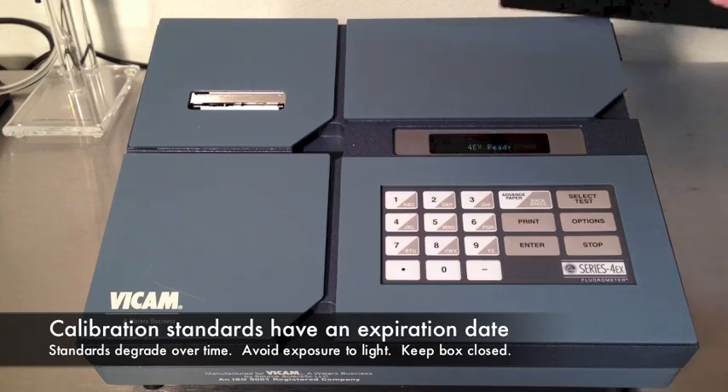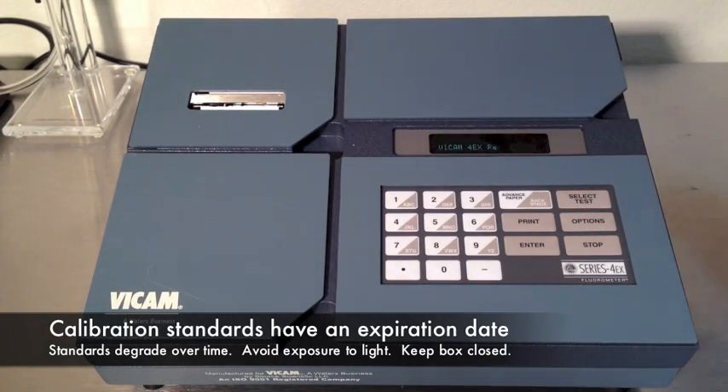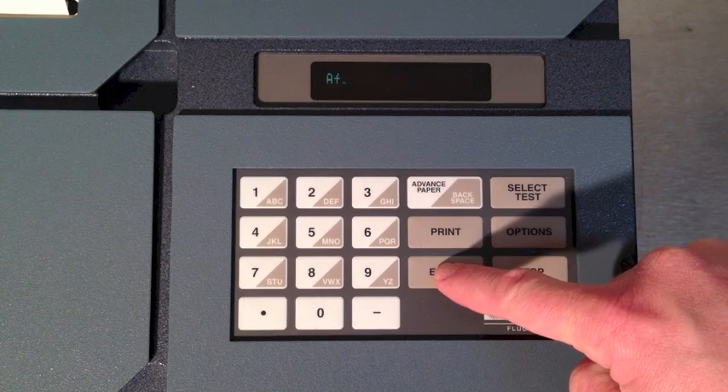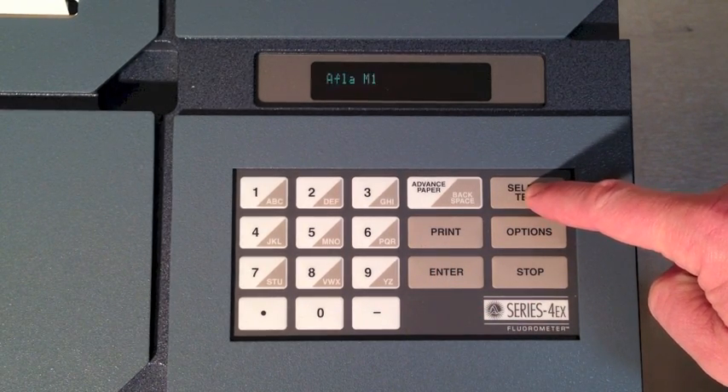Prepare the fluorometer by calibrating. Calibration standards have an expiration date. Use only current calibration standards. Press the Options button, choose Calibration, and select the test you'll be running — in this case AFLATEST — by pressing the Enter button.